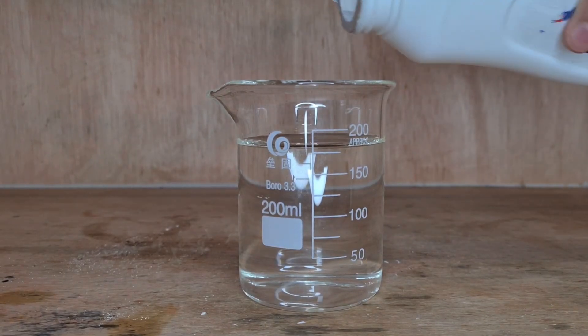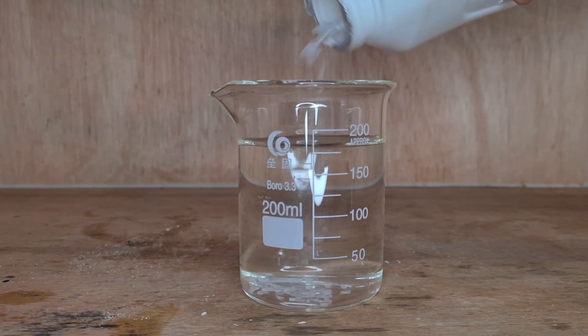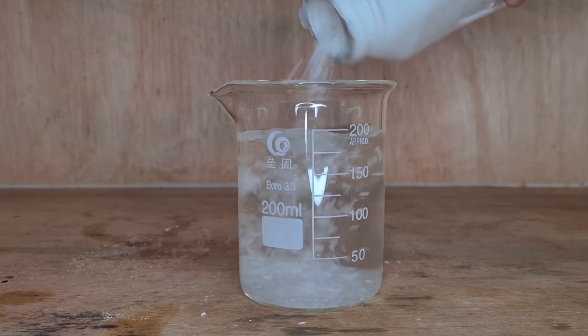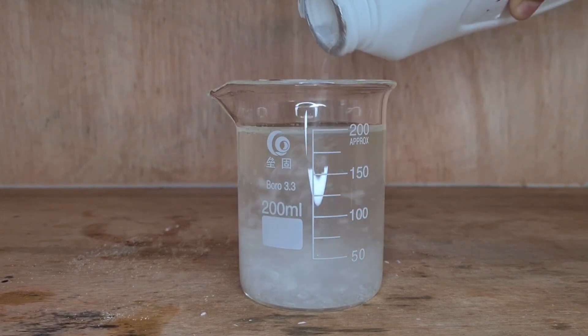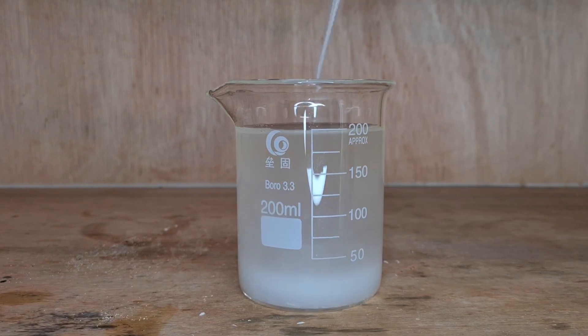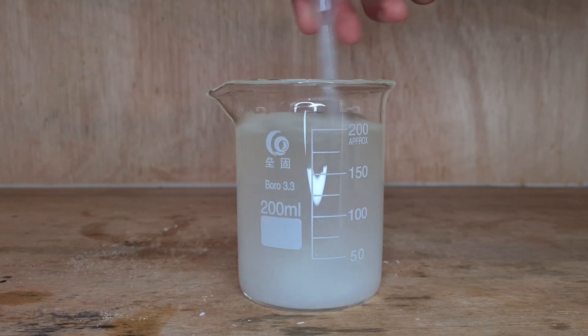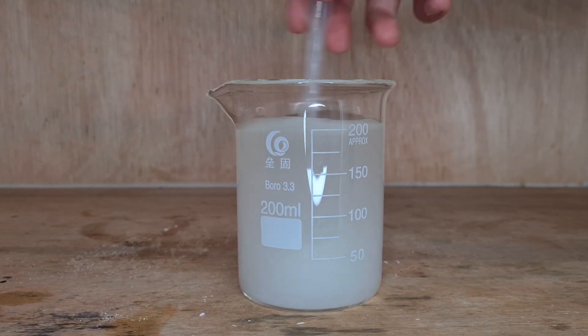So to about 175 milliliters of water, I'm going to add 50 grams of sodium hydroxide. Now we're going to mix everything until all the sodium hydroxide dissolves.